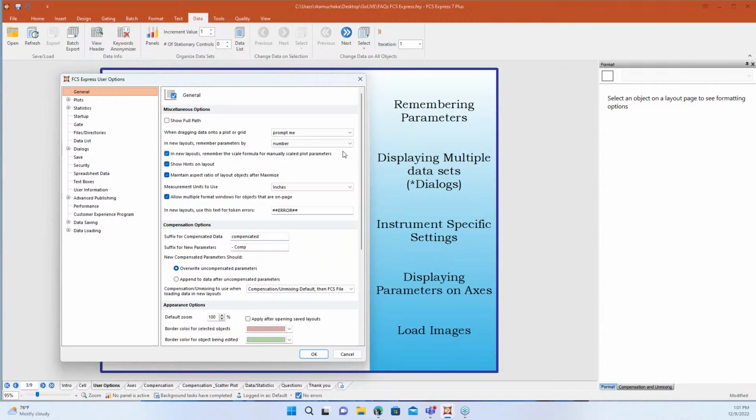Now, like I said, there are some good things and bad things from doing either way. Number is decided by the instrument, so it does decide the number order, and it also determines the name. We have some options where we can customize how FCS Express looks at that name if you wanted to include name and stain, and we'll be looking at that a little bit later when we look at instrument-specific settings. Holly, what are some of the questions that you've seen related to how FCS Express remembers parameters?